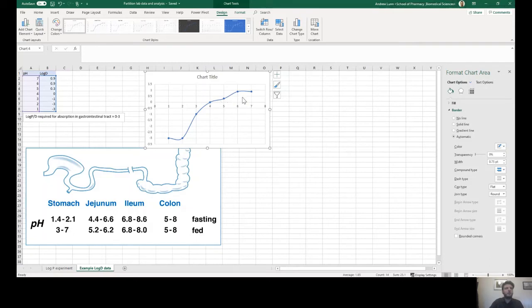And that's because we'll have charged 1 or 2 of the basic groups on the trimethoprim molecule. And so here we're moving towards aqueous solubility. We've got to a low enough pH to protonate and charge the basic groups on trimethoprim at this point here. So we can say one of the pKa's on trimethoprim in this made up data, again, don't quote this, is between 5 and 6. So the pH at which 50% of the groups become ionized, i.e. the pKa, is between 5 and 6.